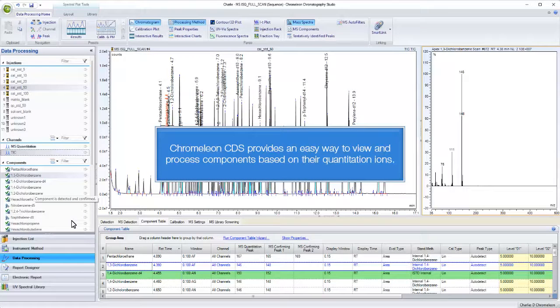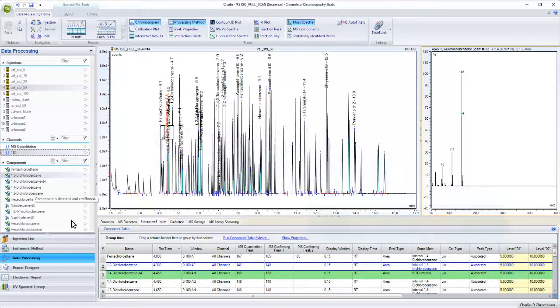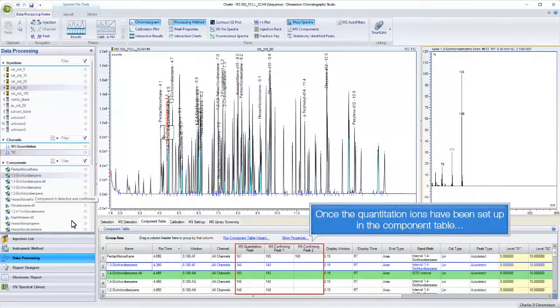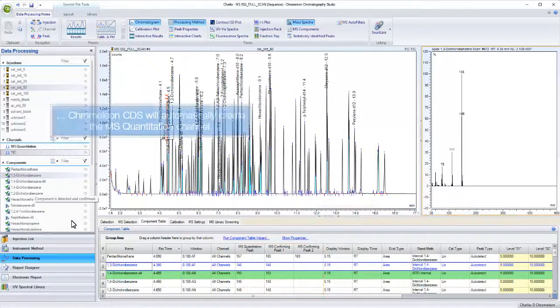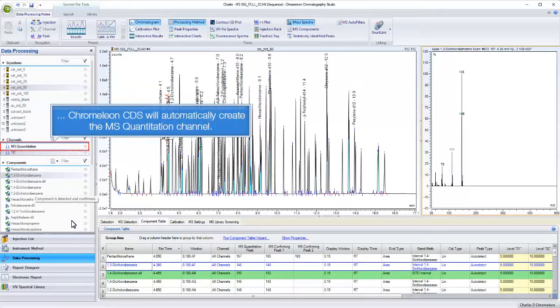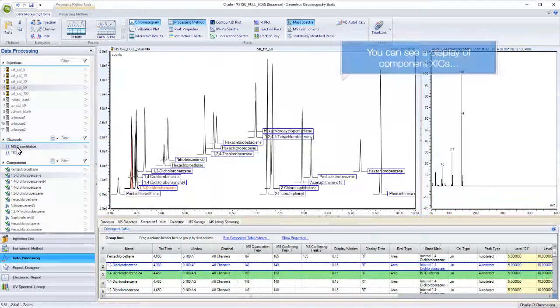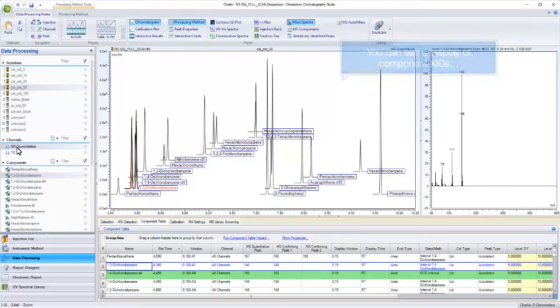Chromelion CDS provides an easy way to view and process components based on their quantitation ions. Once the quantitation ions have been set up in the component table, Chromelion CDS will automatically create the MS quantitation channel. You can see a display of component XICs.